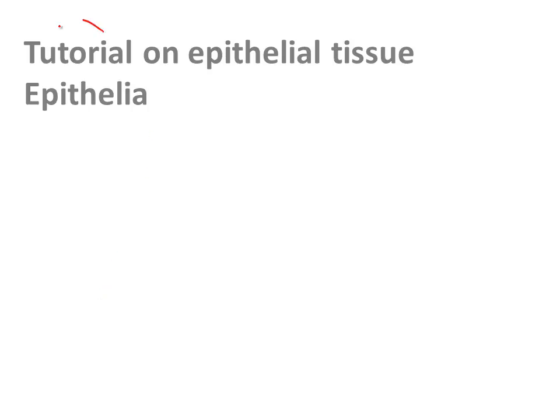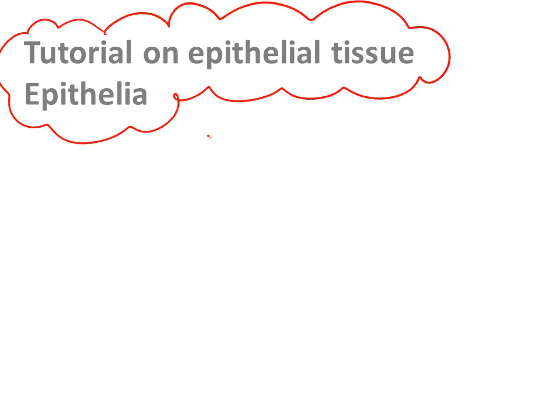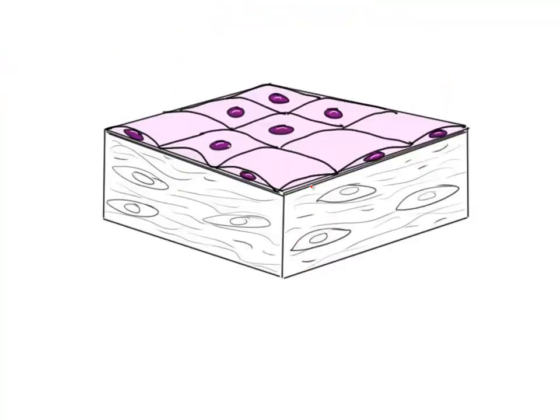This is a 5 to 7 minute tutorial on epithelial tissue. This will help you for lab and lecture. Some of these images we went through pretty quick in lab.